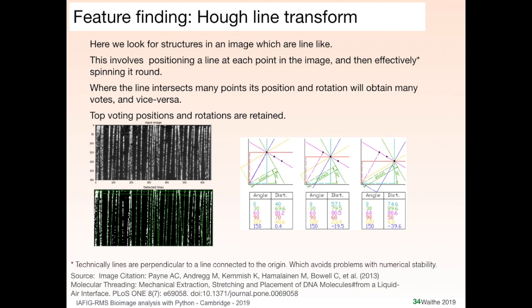So this is nice if your biology happens to form straight lines, but who's lucky enough for that to happen, huh? Only people that are streaking out DNA, it would seem. But if you have an opportunity to use it, it's lovely. I mean, I did do segmentation on this, but it was a very simple segmentation, and in theory, you don't need to do a segmentation. You can do it on a grayscale image. So it's a very elegant thing if you've got the right biology for it.